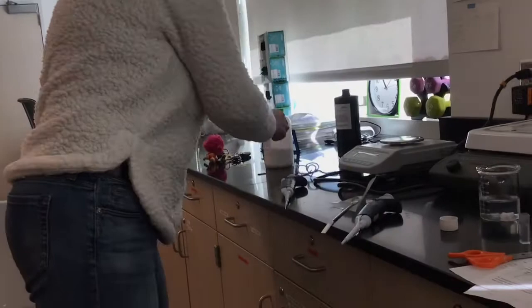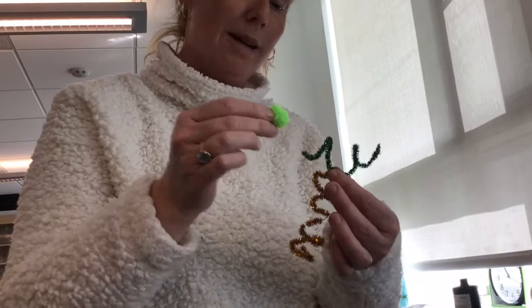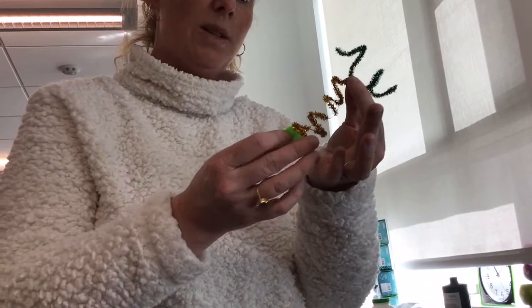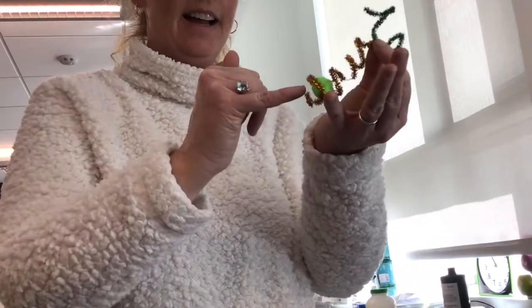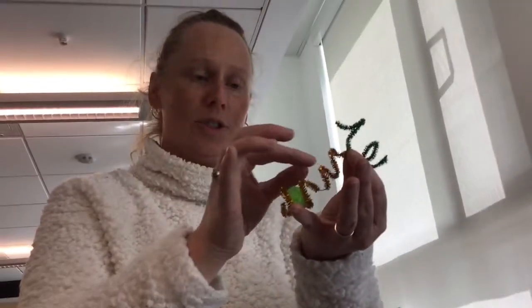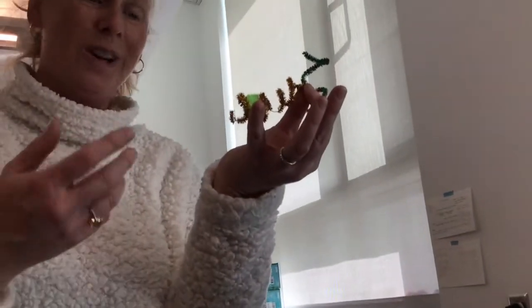So what we're going to be using is this, which is supposed to model iodine. So you guys might remember from Bio 1 labs that iodine has this affinity for starch. And the reason why it does is that the iodine atoms will actually very nicely fit in the alpha helix structure of amylose or amylopectin. So what happens when iodine is sitting here in the little alpha hole of amylose or amylopectin is that you guys might remember that it makes a bluish color, like a bluish kind of purpley color, right?